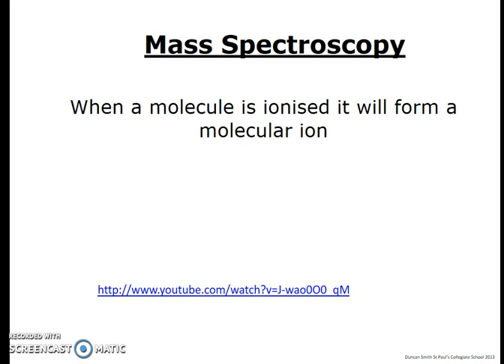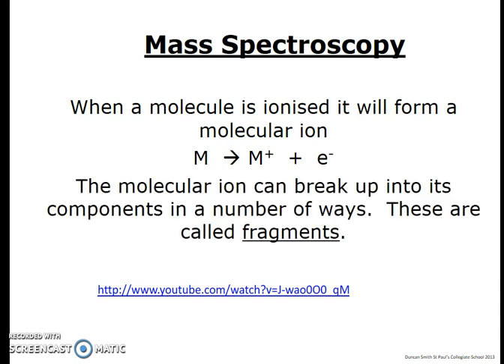The molecular ion is really useful because it can tell us the molar mass of that compound. So we take our molecule and it becomes charged by simply knocking an electron off it, and then it breaks up into fragments.